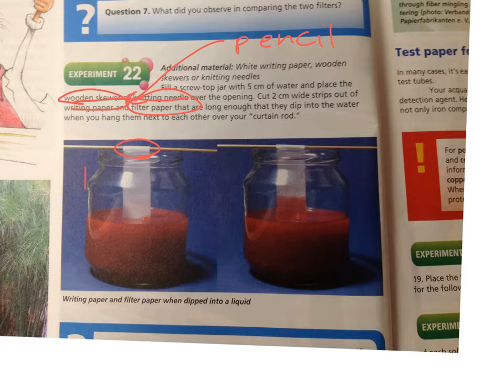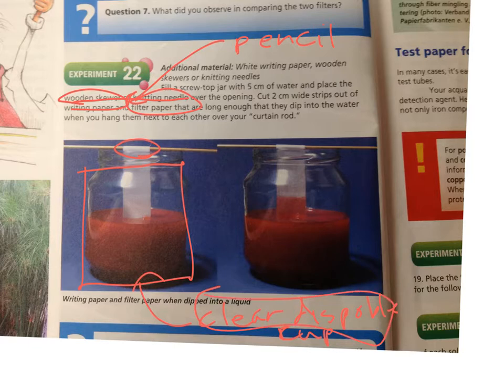And there is nothing magical about baby food jars. Now you want a clear thing, and you don't want something you're going to put food into later. So you can use a clear disposable cup if you can find one, which is what I did. Rather than use baby food jars, I had a couple of glasses, some plastic cups left over from a party that I simply used. The shorter the container, the better.